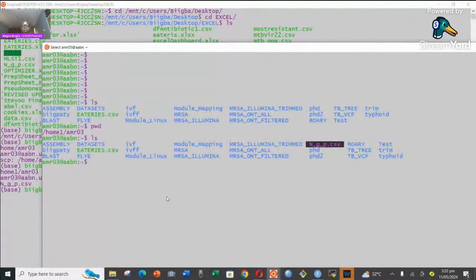Now let's assume that you also have a text file, let's say a FASTQ file, that you want to use in R. You want to use R to analyze, let's say, microbiome data. The same way you copy the FASTQ file using the same approach onto the remote server, first, before you now copy it from the server environment to RStudio.